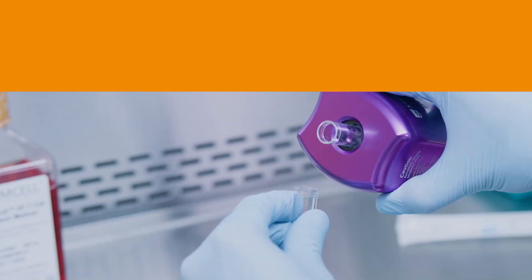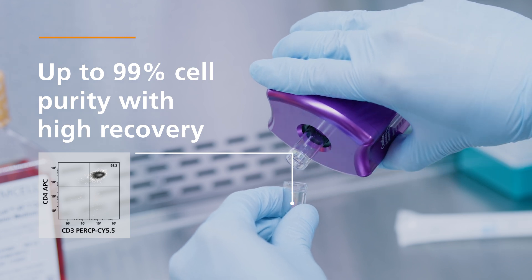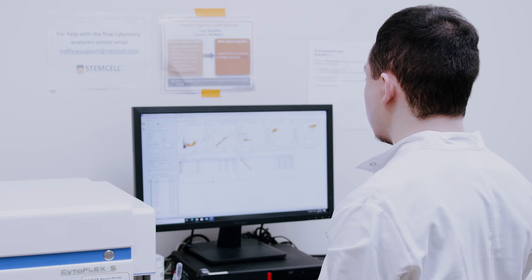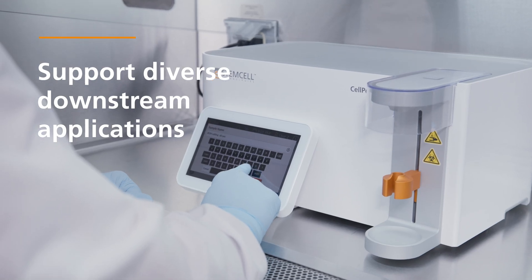With EZSEP, achieve up to 99% cell purity with high recovery while maintaining cell viability and function. Then use the highly purified cells in a broad range of downstream applications.